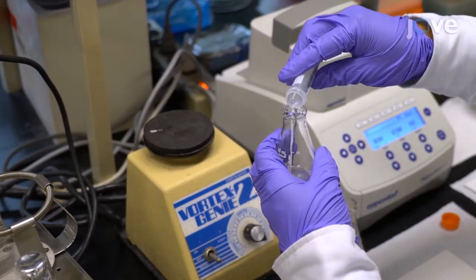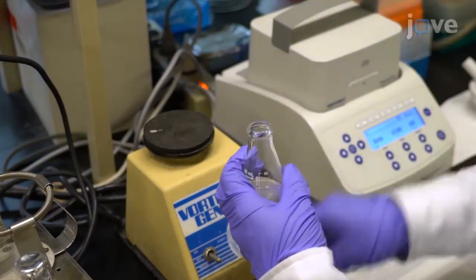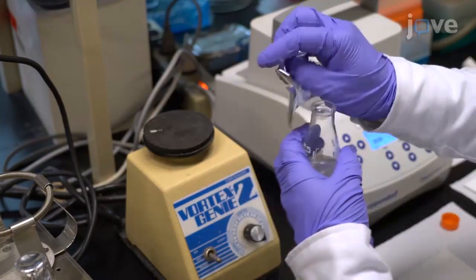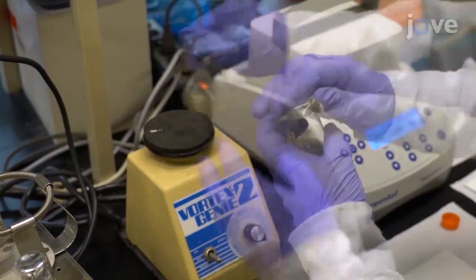To begin, add 10 milliliters of acetone to the lyophilized cells and seal the flask before mixing with a vortex mixer for 30 seconds.